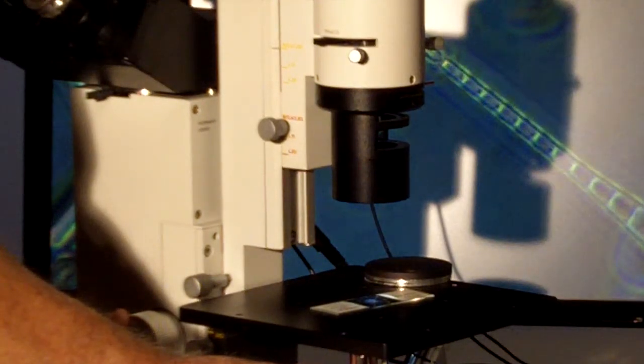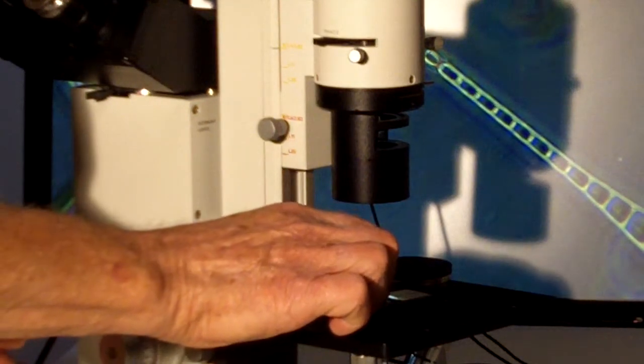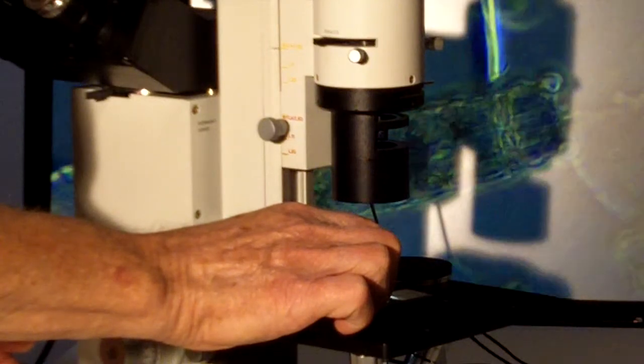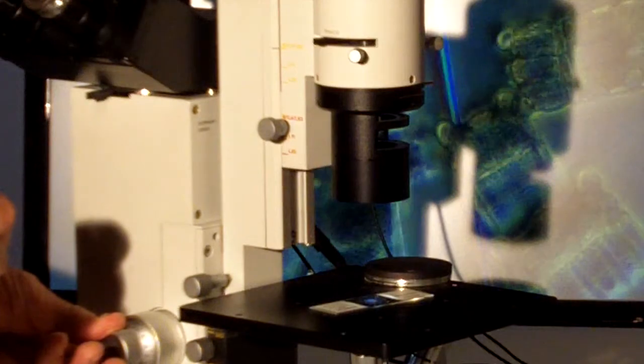We can quickly go to high magnifications changing focus on the fly. This is the 20x objective. Notice I didn't have to change the phase rings.